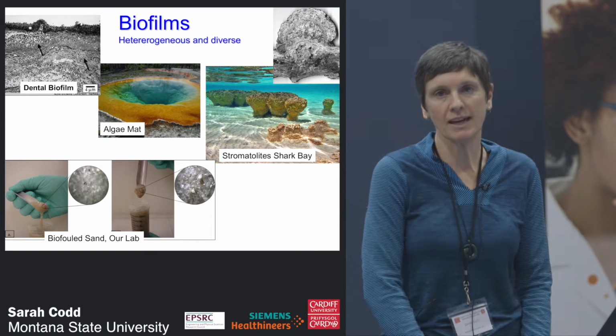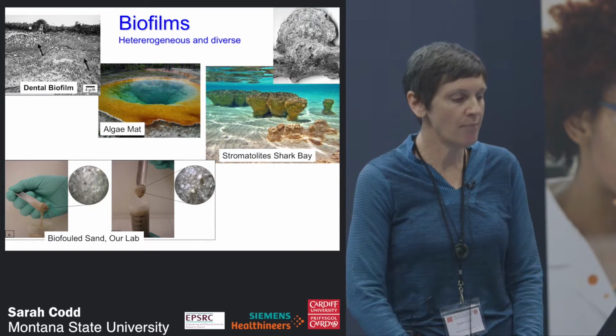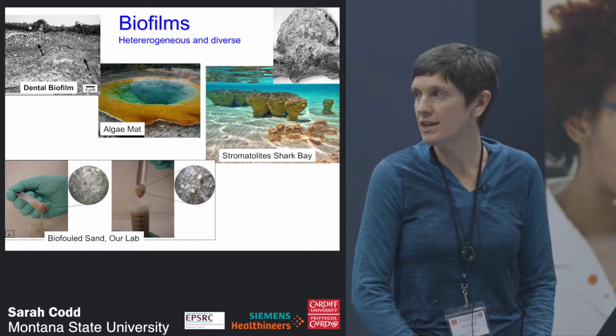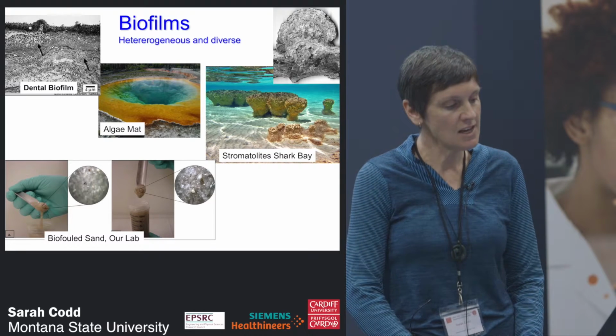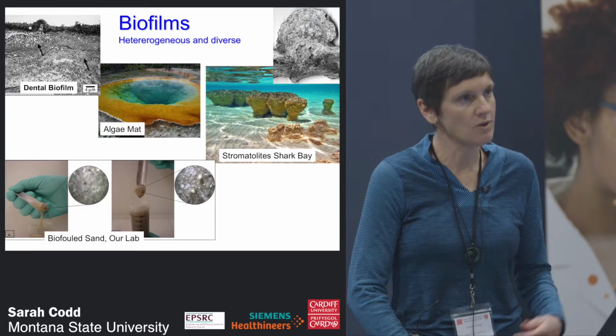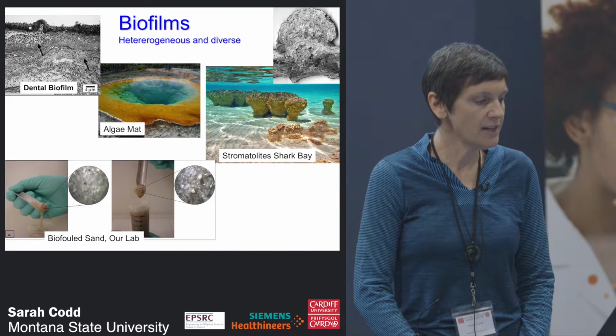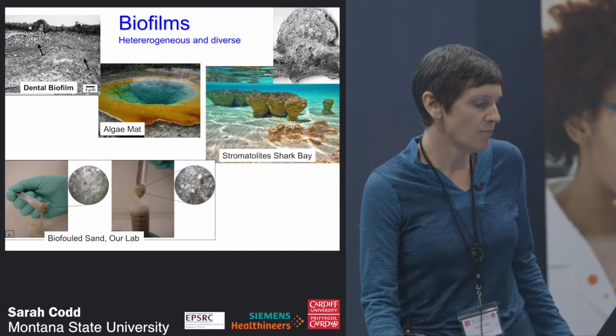So one of the first applications we found ourselves applying the NMR propagator measurements to was the biofilm. The Centre for Biofilm Engineering is in Montana State University. It's one of the world's most renowned places to study biofilms. And so the idea with the biofilm, here's a number of biofilms that you can see.